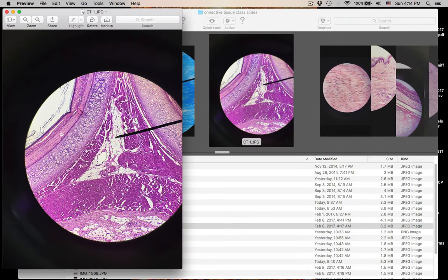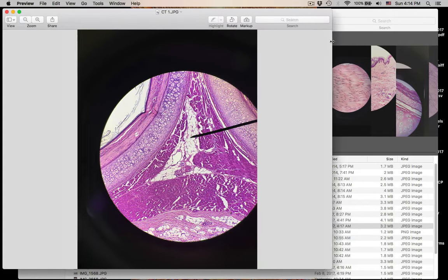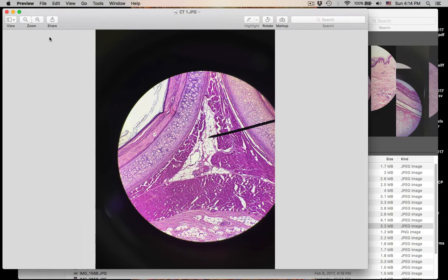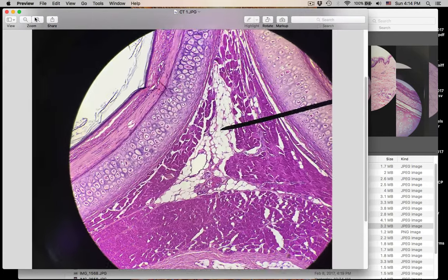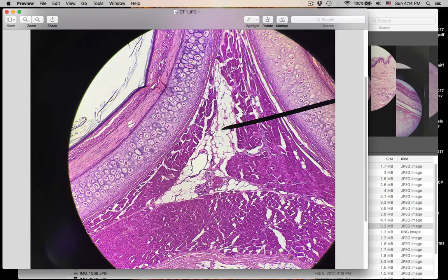Number eleven is adipose tissue — adipose connective tissue. It's surrounded by other tissue types; this is actually from the epiglottis, so there's going to be elastic cartilage here and here. But what we were looking for was: what tissue is this? This is adipose connective tissue.